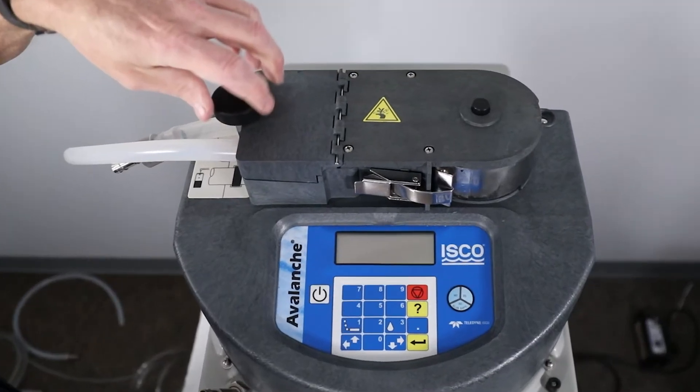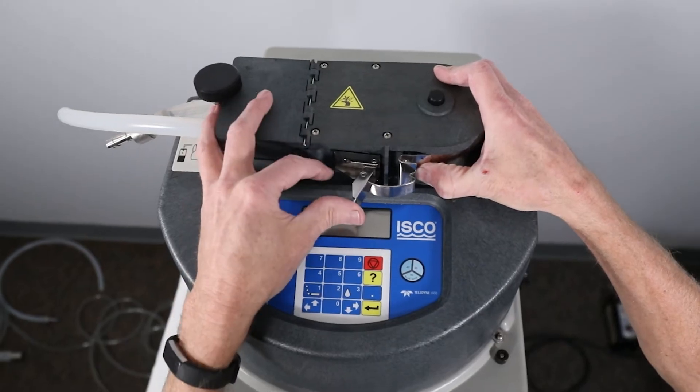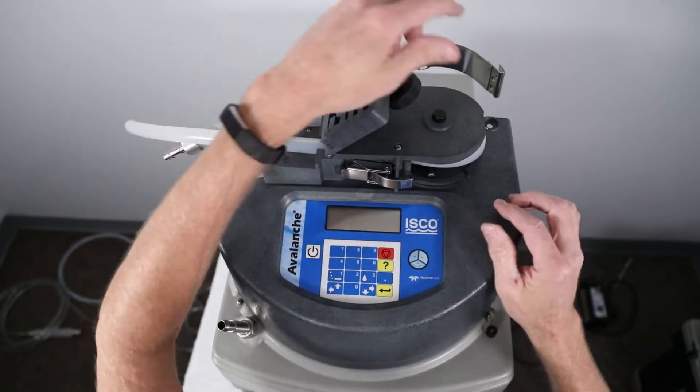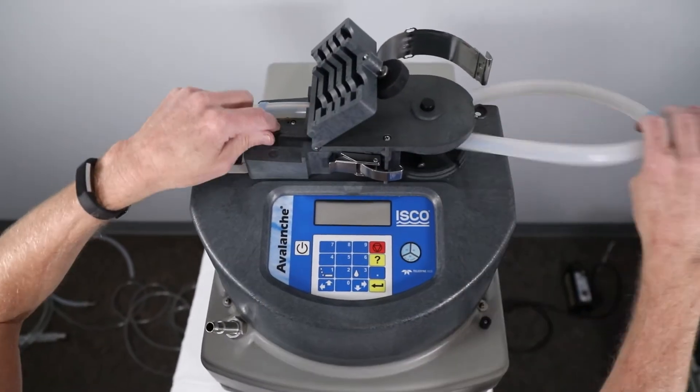Loosen the liquid detector cover thumb screw. Open the pump band latch and rotate the band out of the way. Pull the pump tubing out of the sampler head.